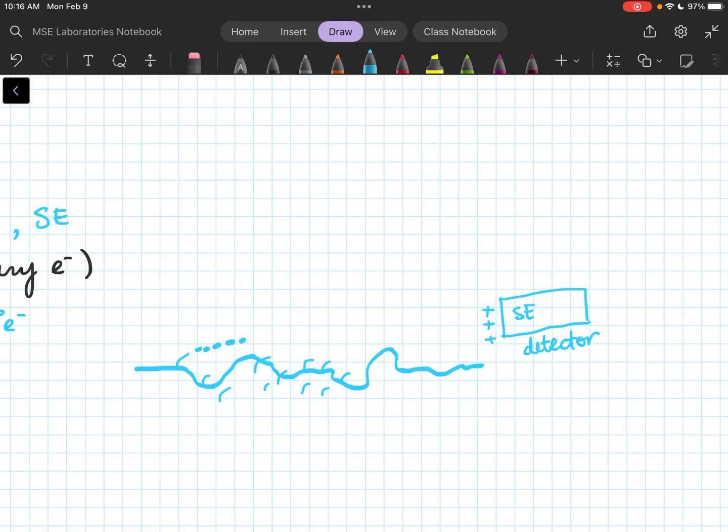Why are we doing that? Sorry, sometimes it is so very thick, and I don't want it to be thick. I just want it nice and thin.